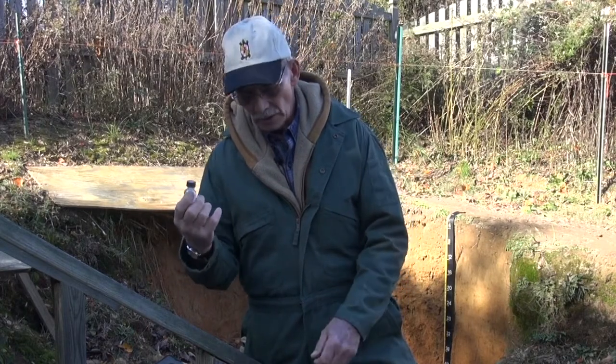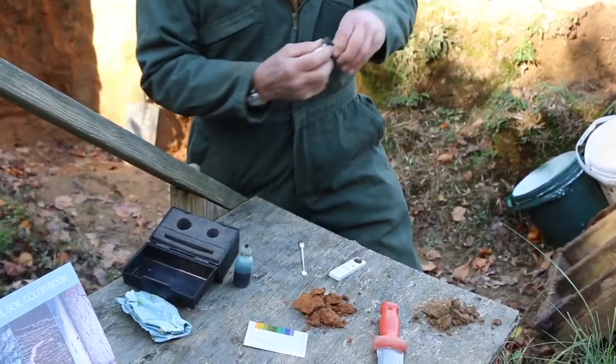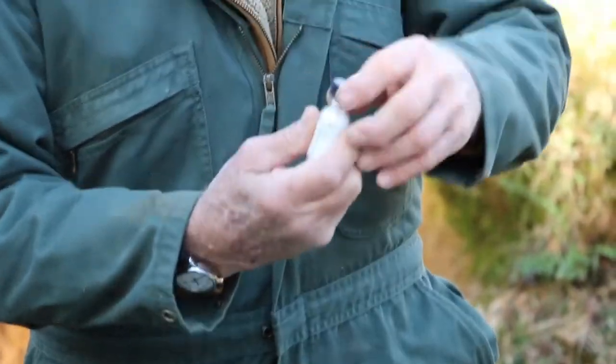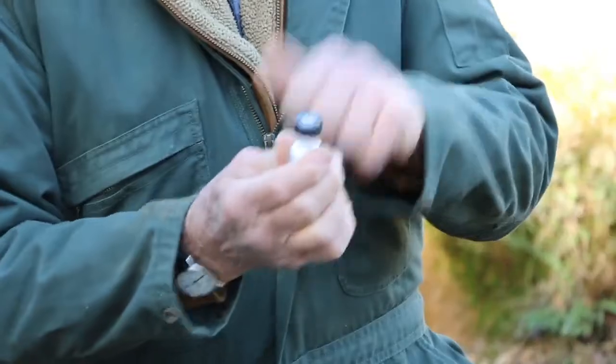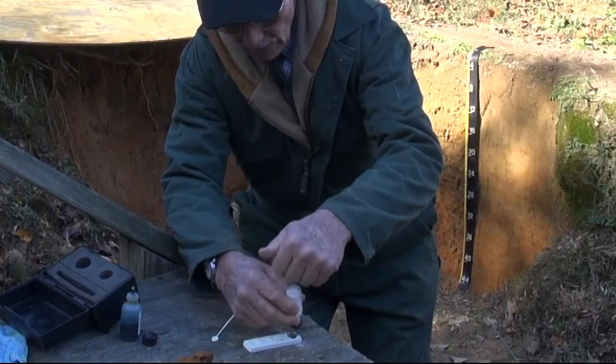It's important when using the powder that you remove the cap off these chemicals by pulling it off and not unscrewing the cap. This has a screen on it that will allow the powder to come out as a powder. Hold it over the sample like this and peck it just a couple of times.